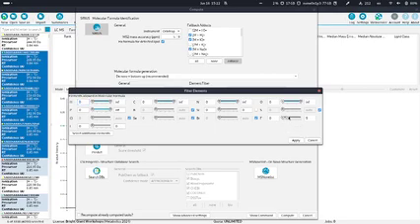What is important here is that the slider actually goes to infinity. If you pull it all the way to the right, you will have inf standing here, which means it can consider the possibilities for any number of fluorine atoms, and it can increase the computational cost by a lot. So if you use this, you should probably select a reasonable upper limit for this auto detection. You can also select additional elements if you really want to here.